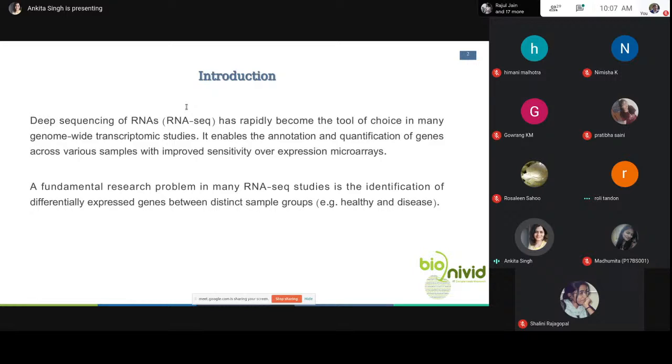Similarly, if you have some study in your mind wherein you want to compare between two conditions, say for example, take a normal example. If you apply a sunscreen lotion on your body, you want to see what is the change you are getting after application of some chemical.